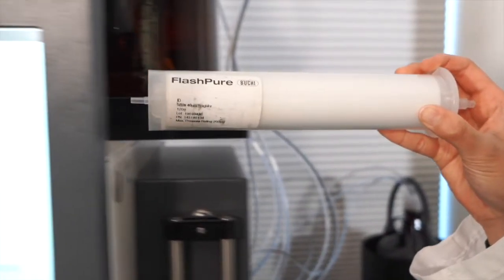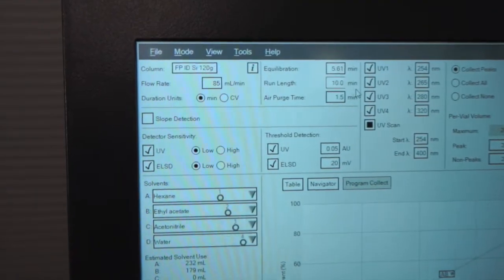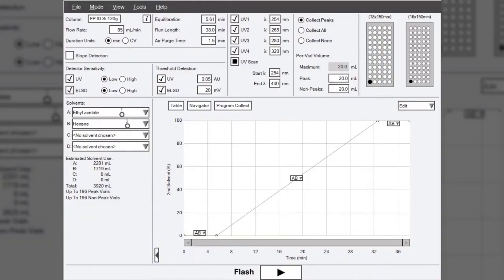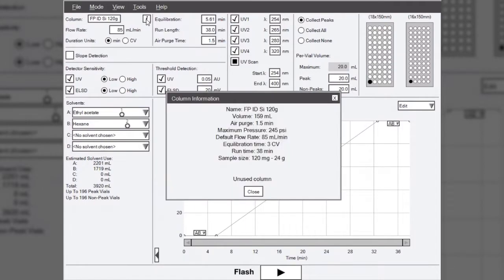There is also an RFID reader on the top of the instrument behind the right side of the display for scanning tagged cartridges. Once the cartridge is scanned, the system updates with the stationary phase, size, and flow rate, and will show the loading range of sample as well as if the cartridge has been used previously.